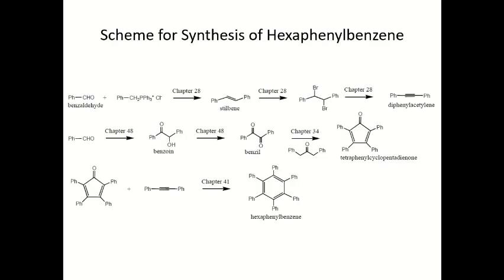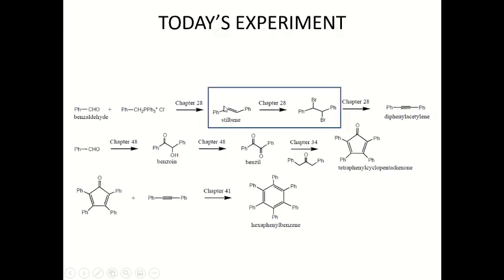As an introduction, here you can see the whole pathway of the synthesis, which you can look into in more detail in chapter 28 of your book. This is the whole scheme of the synthesis of today's experiment.